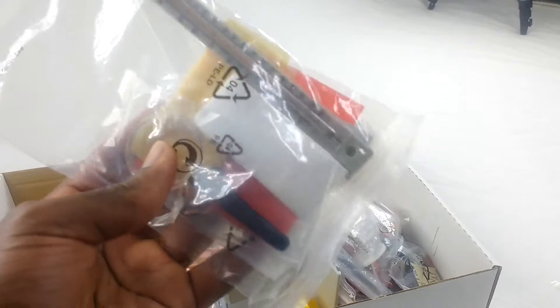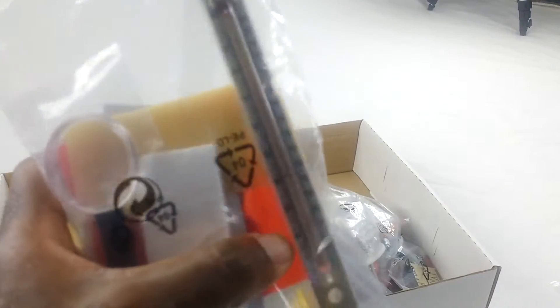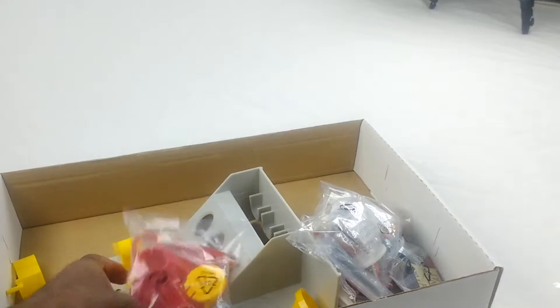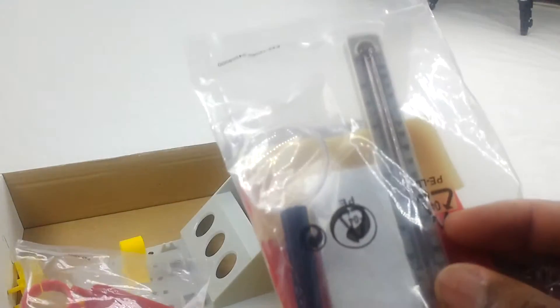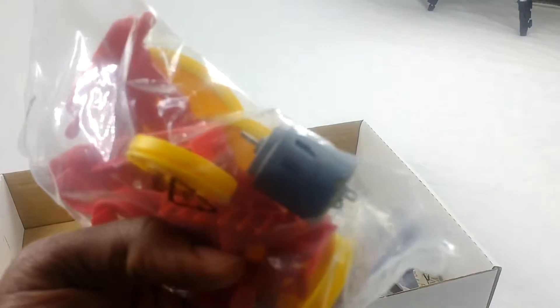This is salt — it has not been opened. I got a little magnifying glass. And a little thermometer — this is also all sealed and has not been opened yet.